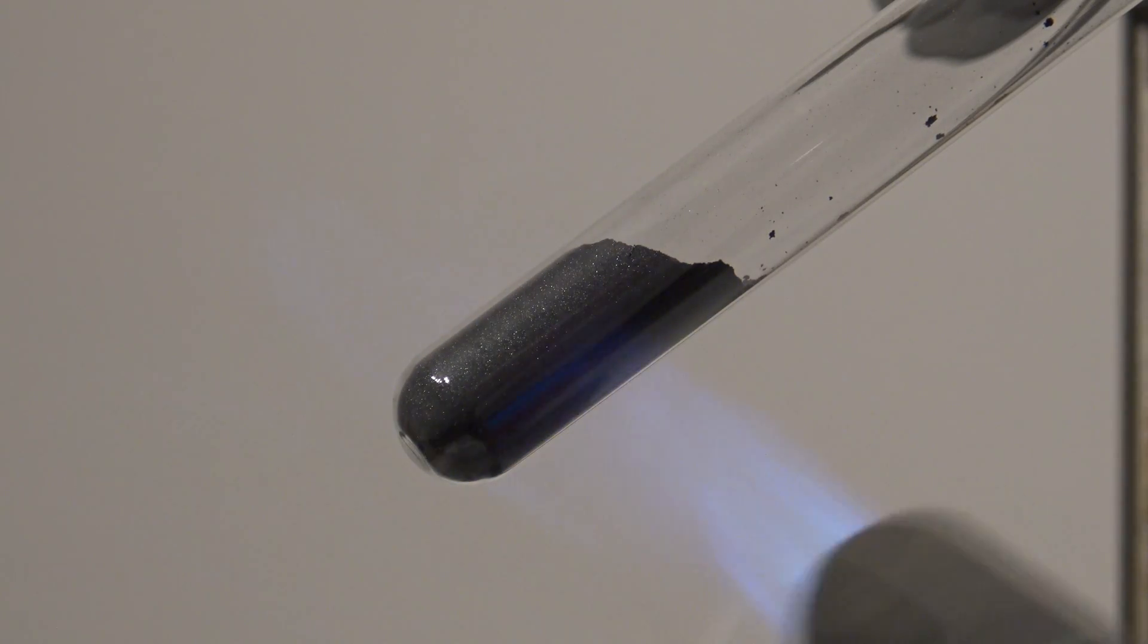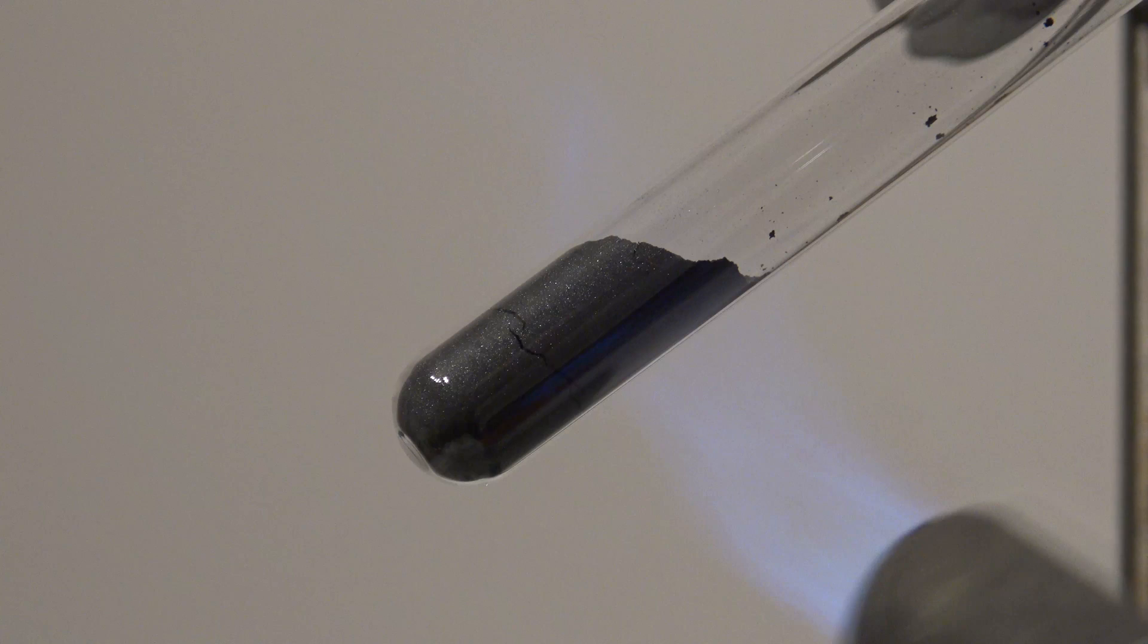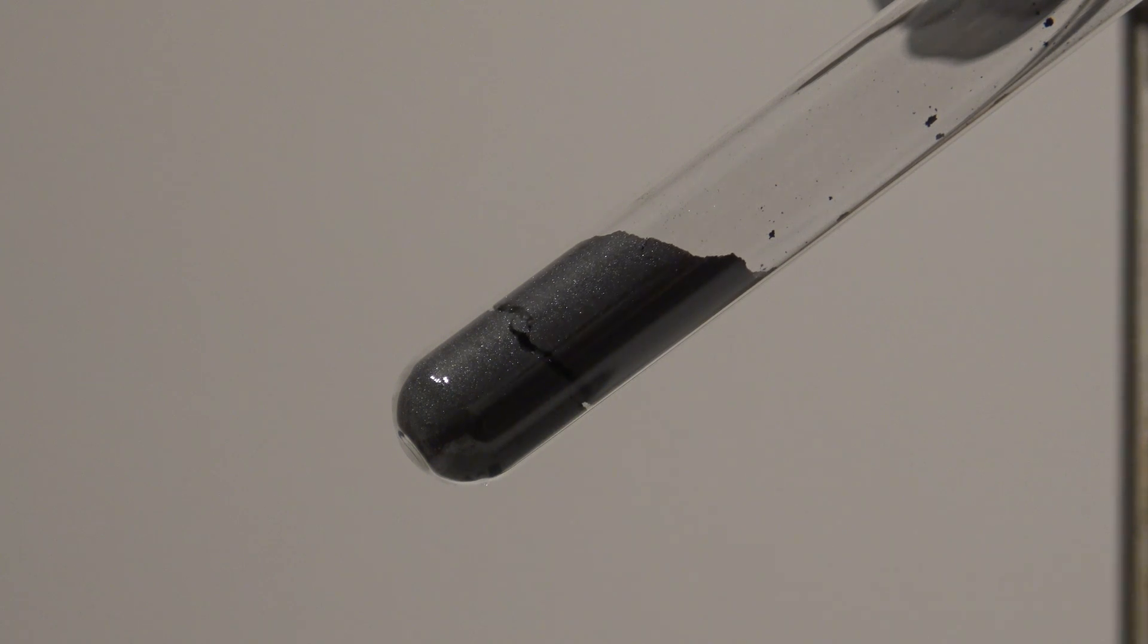Then the test tube was heated strongly with a burner until a reaction took place. Especially in the beginning, pockets of gas began to form slowly. By tapping the tube with a spatula, the pockets in the mixture were removed.